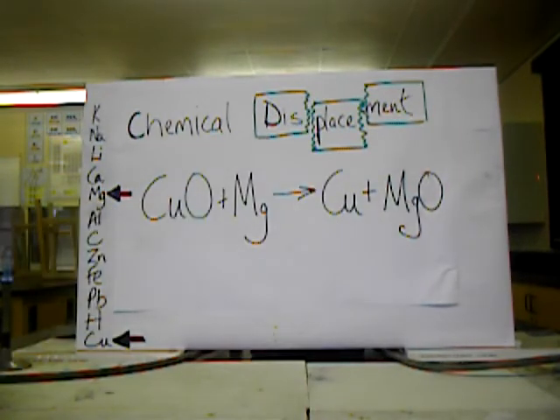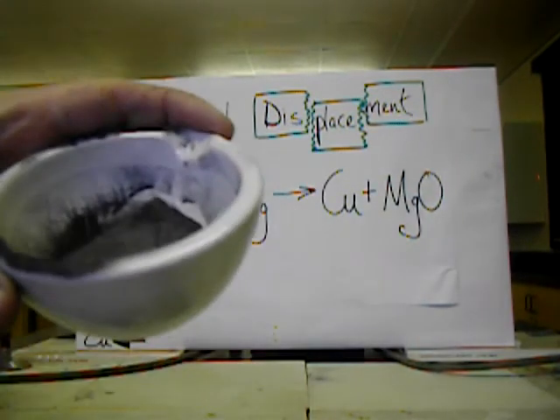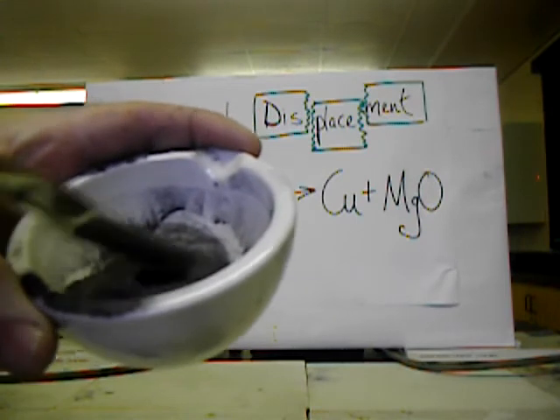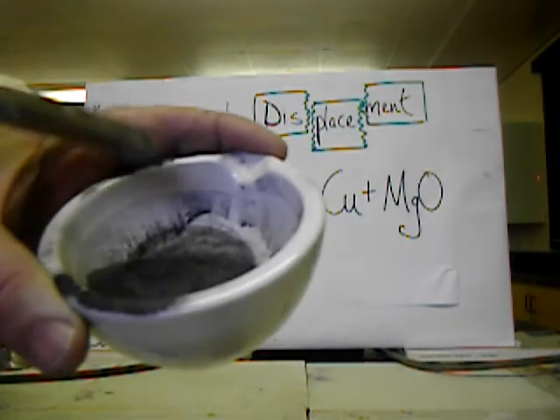And using the pestle, I have ground this to produce a blended mixture of the two chemicals you see on the board: copper oxide and magnesium.